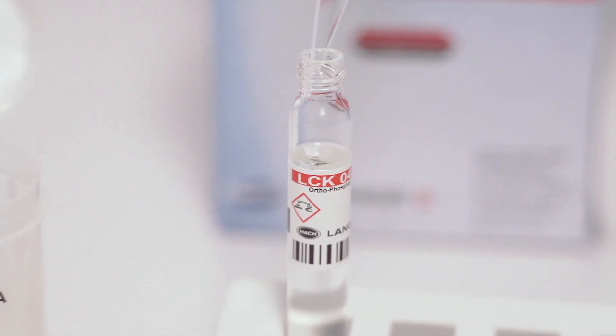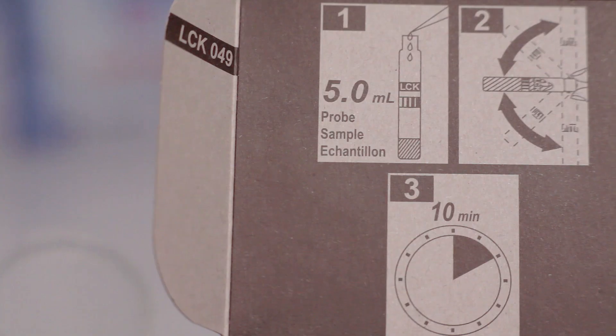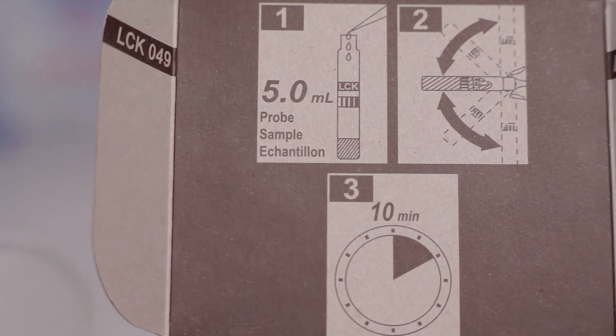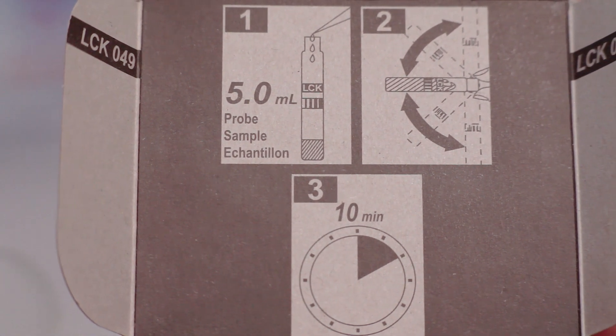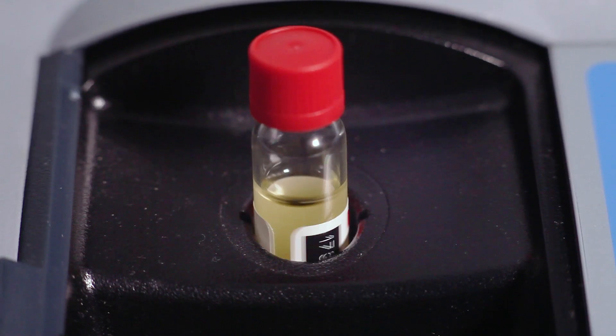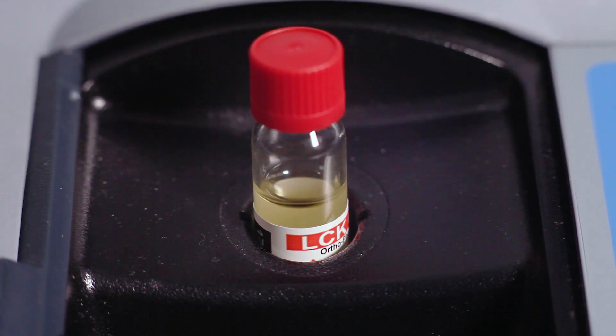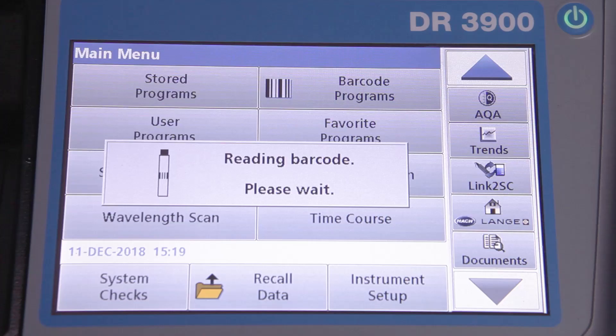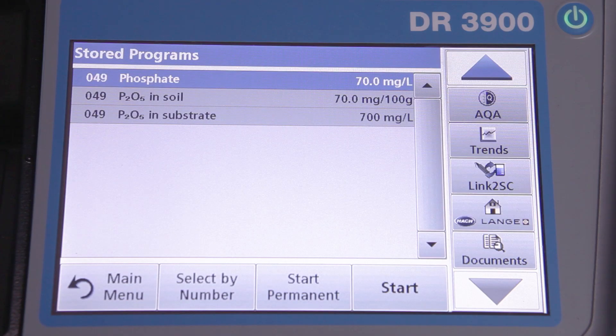After inserting the necessary amount of sample in the cuvette, there is a necessary waiting time, which is specified on the box of cuvettes. When the waiting time has passed, the cuvette is finally ready for analysis. The photometer rotates the cuvette to read its barcode for automatic recognition.